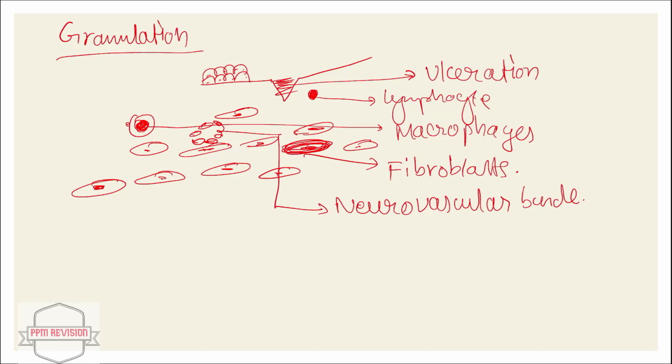And then amidst the fibroblasts, there is a variable infiltration of inflammatory cells which are polymorphs, lymphocytes, plasma cells and a few eosinophils. Amongst this, you can also add other structures such as the lymphocytes that's already mentioned here, and also the plasma cells and a few eosinophils as well.